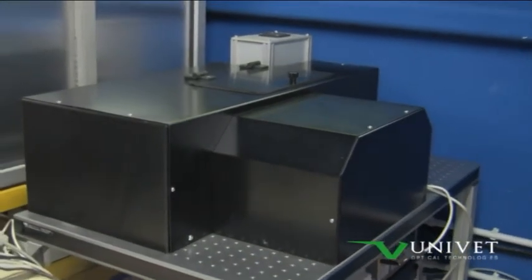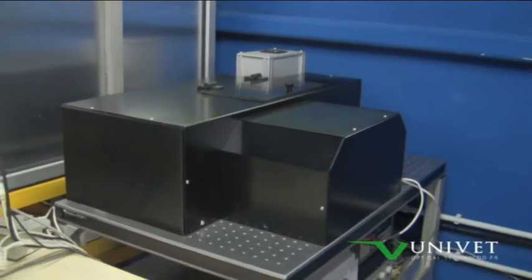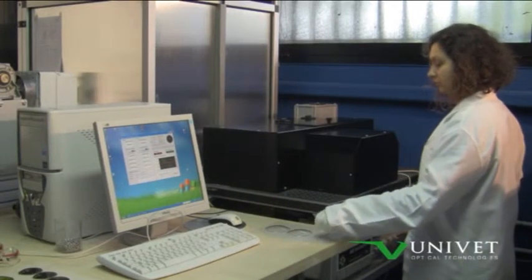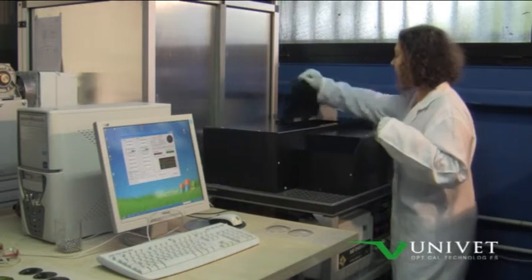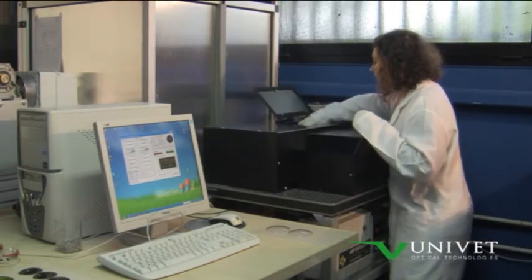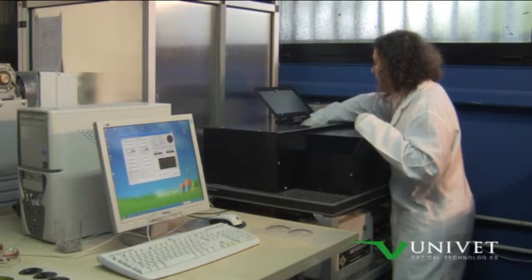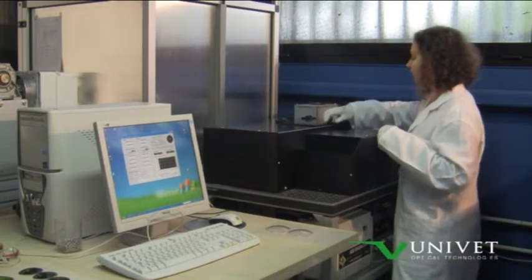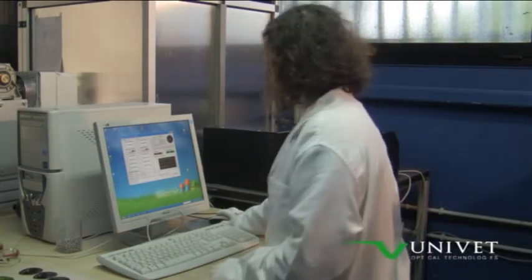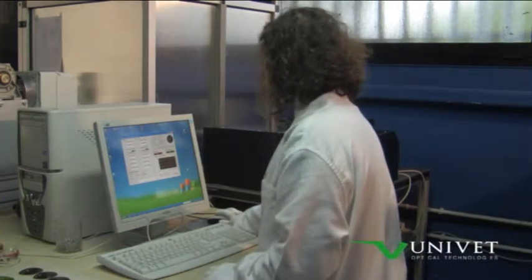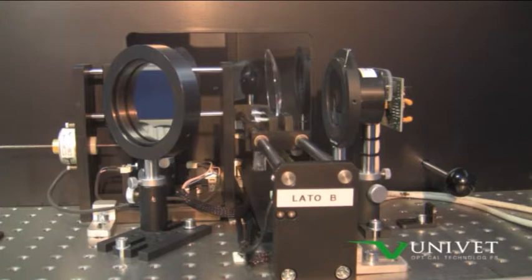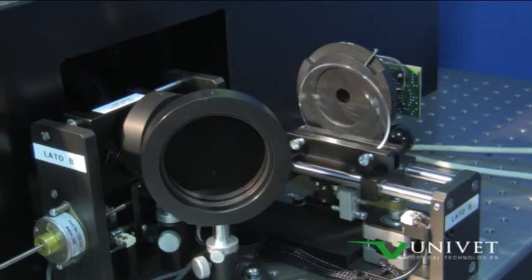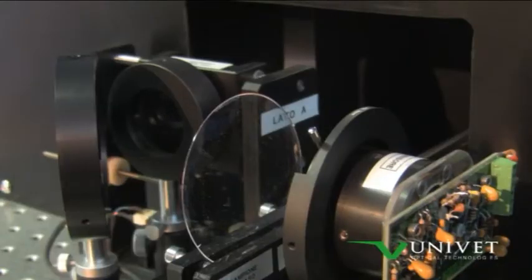The measure of the sharpness of a lens is a crucial step to ensure the best possible vision. Only through a perfectly transparent lens the user is able to effectively perceive the surrounding environment. The bench of the diffuse light is able to measure automatically how much light is scattered from the lens due to its passage through it.